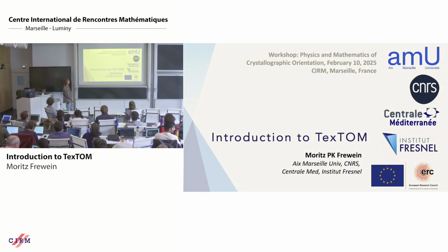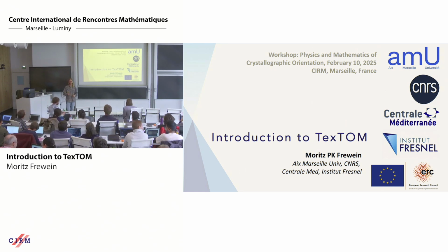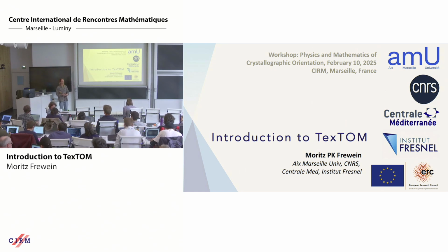So hello again, everyone. In this next part, I will give a little bit of an overview of the software that we're going to use in the afternoon. We call it TexTOM, and I started developing it roughly 2 years ago to do exactly the reconstructions we are talking about.